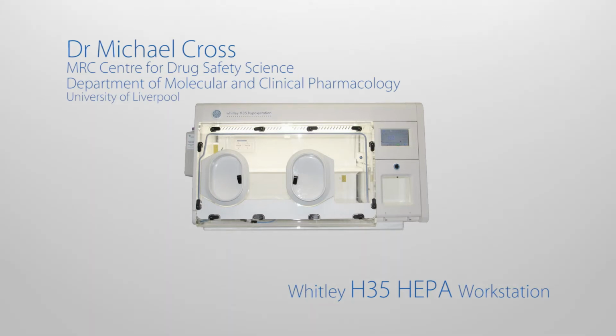We are currently using the Don Whitley H35 hypoxia workstation with the HEPA filter unit. The work that we're doing with the H35 workstation is that we're using it to provide an environment in which we incubate cardiac spheroids, which we form from stem cell derived cardiomyocytes mixed with endothelial cells and cardiac fibroblasts. And this allows the cells to coalesce over a period of time, usually up to about 2 weeks.